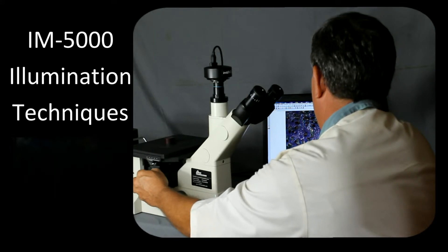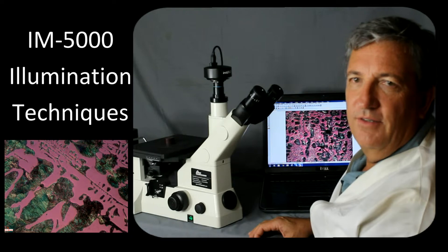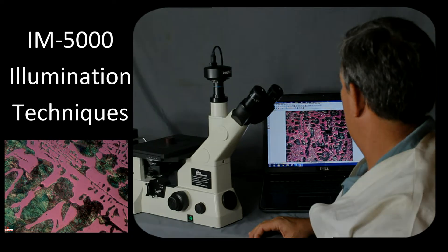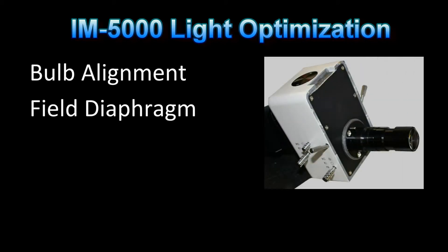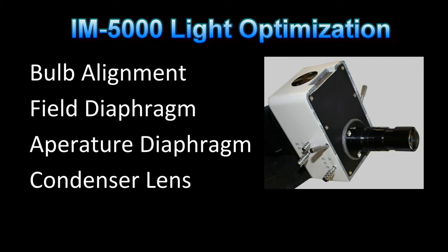To optimize the IM5000, we want to align the bulb, set the field diaphragm and the aperture diaphragm, as well as defocus with the condenser lens.